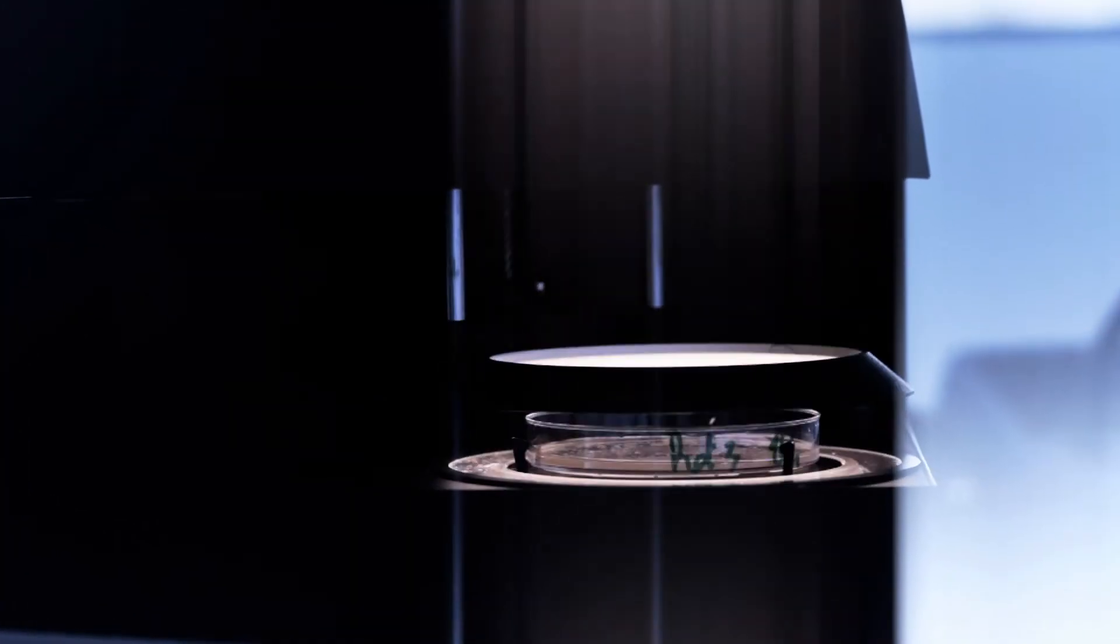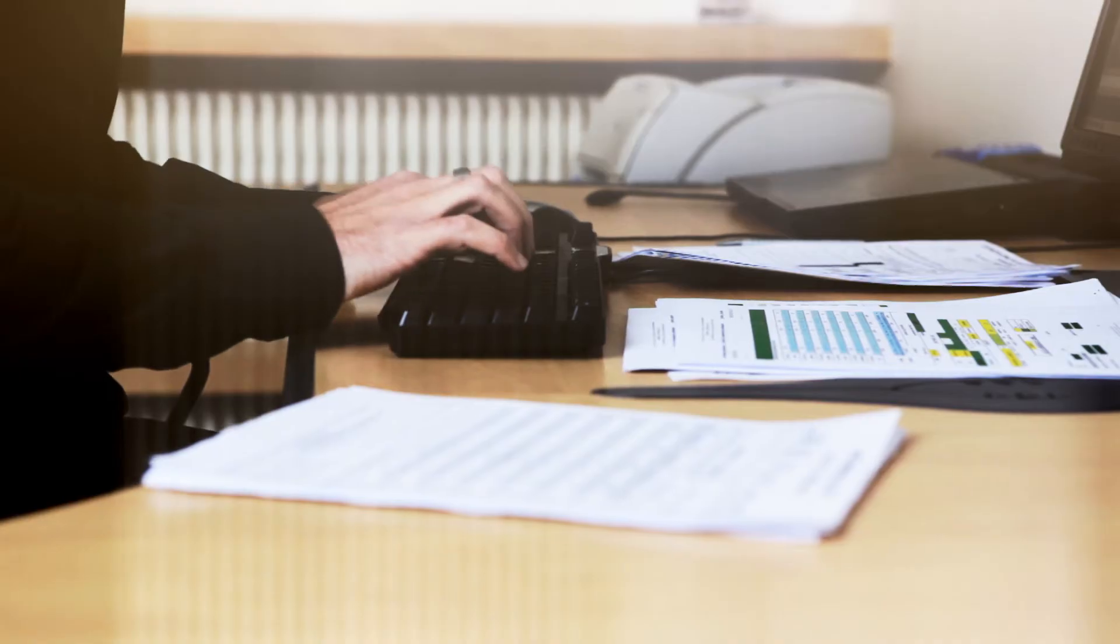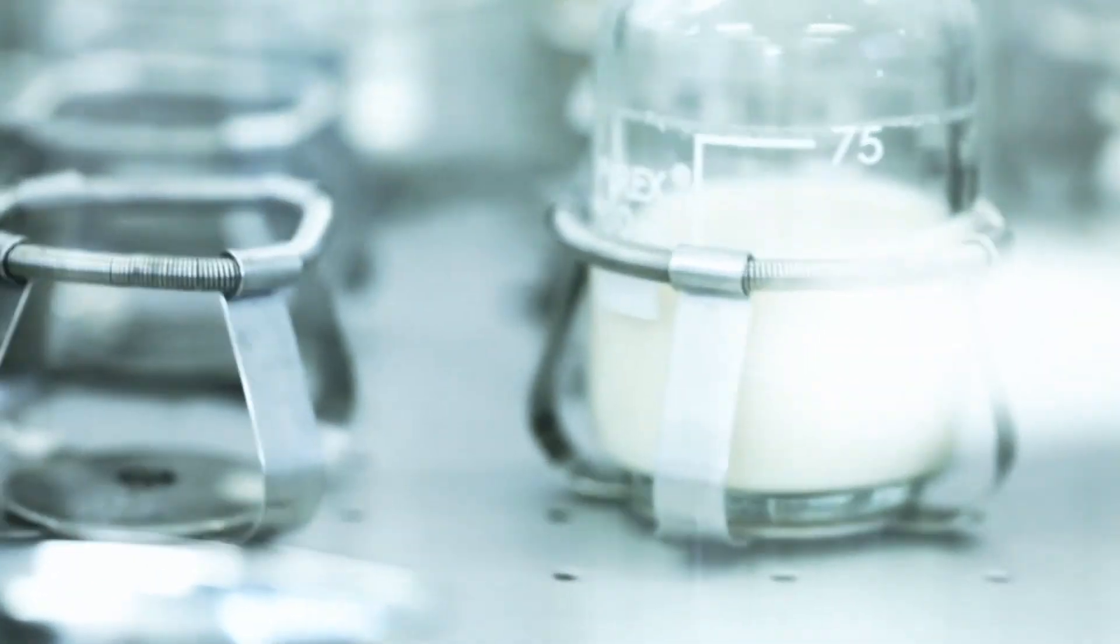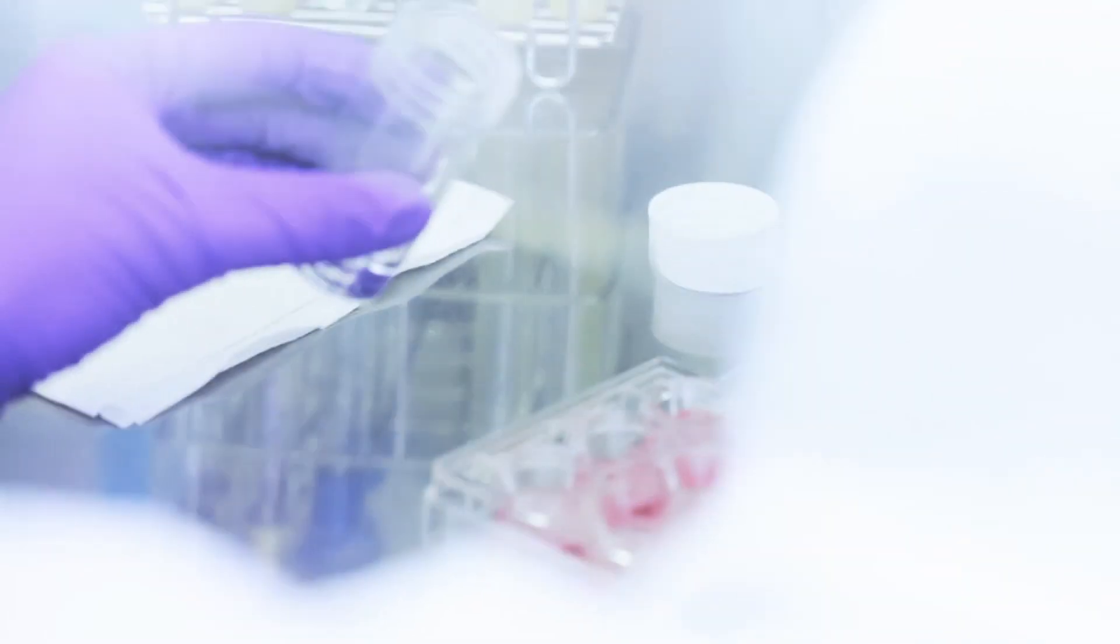Le service Microbiology Corporate conjugue des équipements performants avec les compétences d'une équipe de spécialistes, tous mobilisés pour contribuer au développement de produits innovants, tous profondément investis pour relever les futurs challenges de L'Oréal.